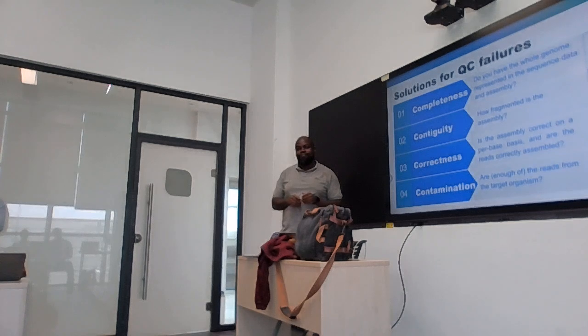So we do, it's recommended that you do a post-run wash. Yes, you do a post-run wash, then multiple maintenance runs just before you do another run. Or you can do a cleanup where you use some percent of bleach to clean up the whole system. Can someone maybe translate?